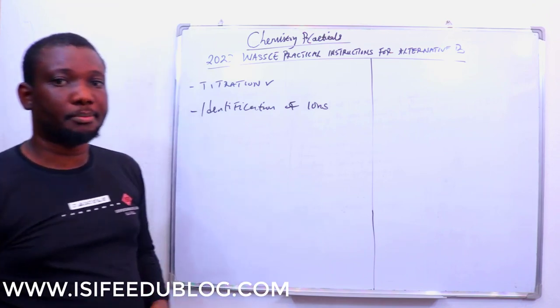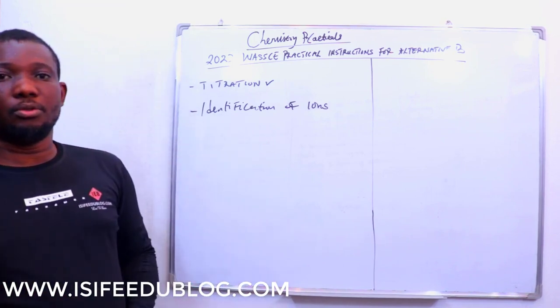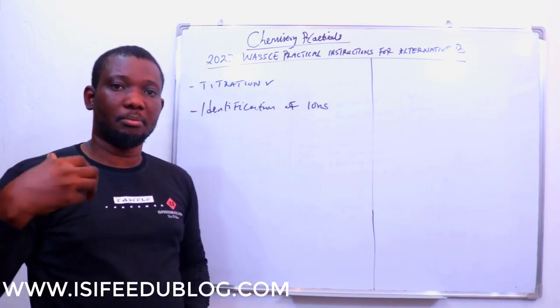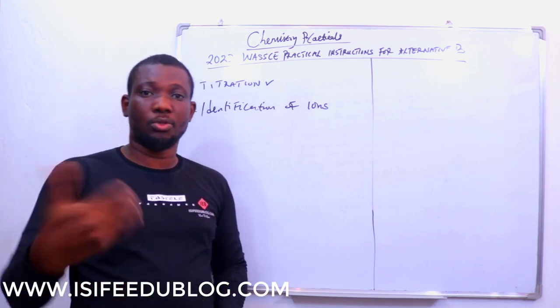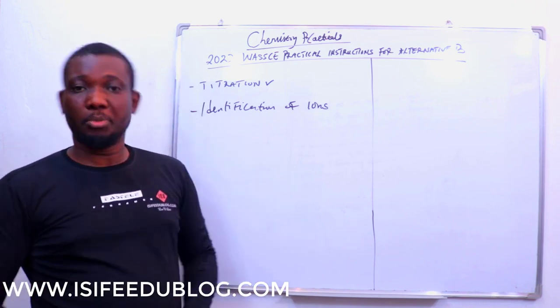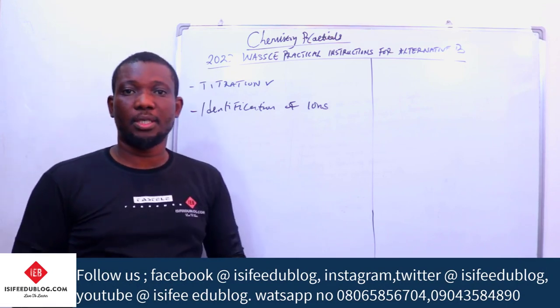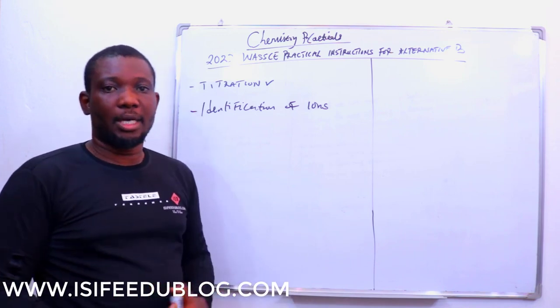So I will start with drafting the question. The endpoint we're going to use in this video varies from school to school, so it is not the endpoint you should be expecting. But if it happens to be the same, no problem, you can go ahead. We're going to teach our viewers how to put up a nice table to earn marks.